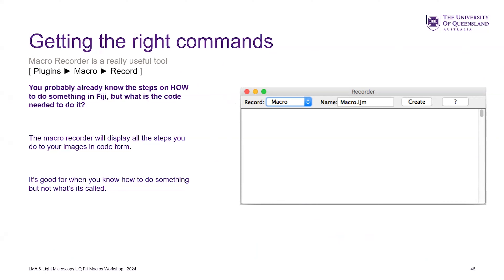You would use this when you know how to do something but need the code. Say you're writing a script and you want to open an image and max project it. I showed you the full command for max projection before. You could fumble your way through with autocomplete to find it, but the easiest is to just have the recorder running and open an image — it'll do all the steps and give you all the commands.